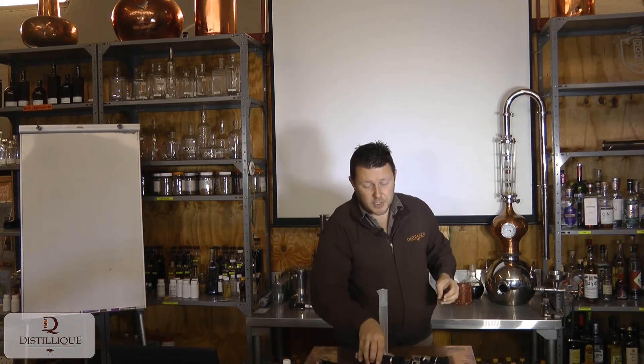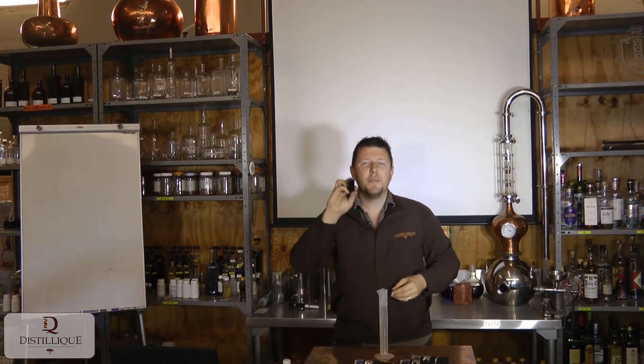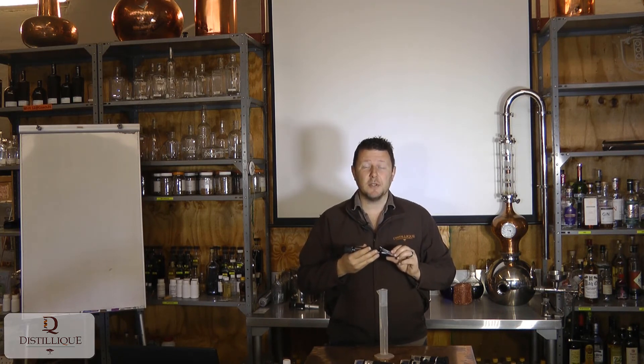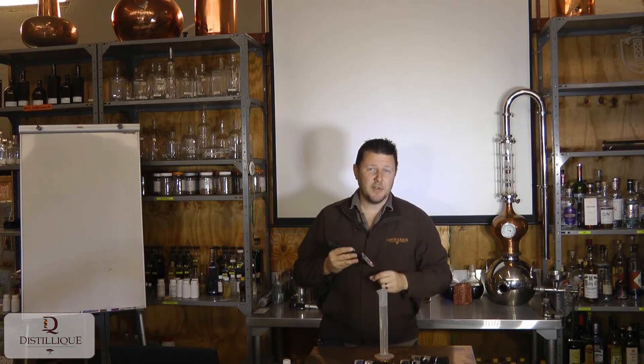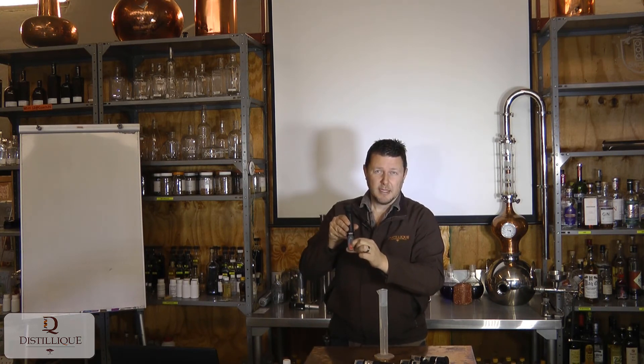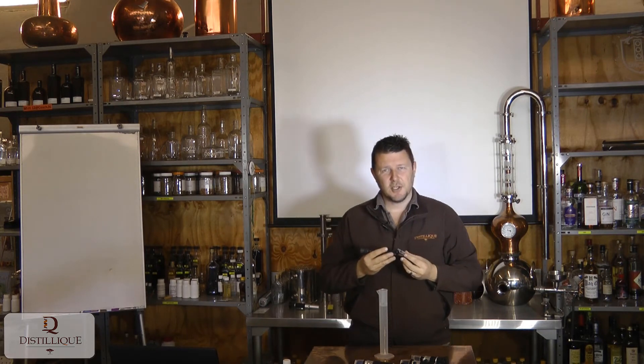The last refractometer we have available here is our alcohol refractometer with a built-in LED. This LED light is correctly calibrated in terms of light wavelength to give you an accurate reading. You just press a little button while taking your reading and you can use it in a dark space, interior space, and so forth.